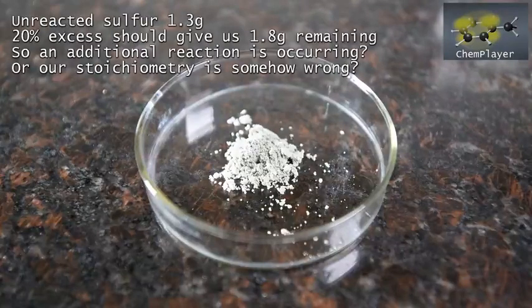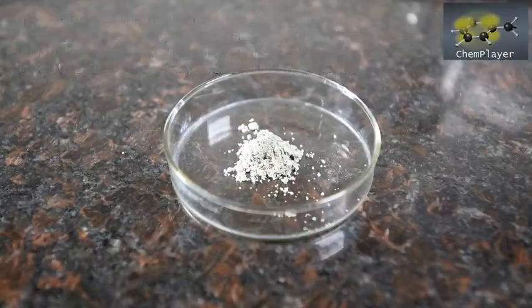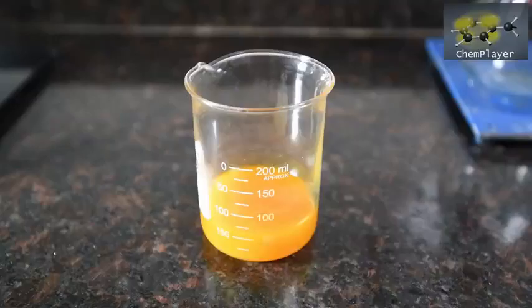After careful drying we're left with 1.3 grams of this gray colored residual sulfur. This is interesting because in theory we had a 20% excess which should have given us about 1.8 grams remaining. So a side reaction has occurred to consume some of the sulfur — but it is a good sign that we've had a reaction occur, so let's work up the filtrate.